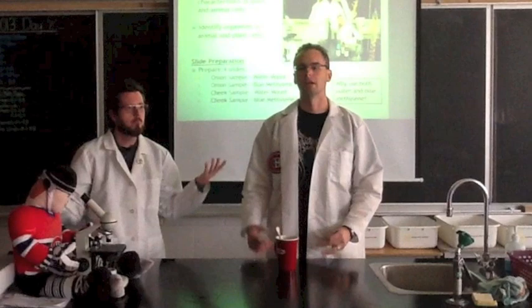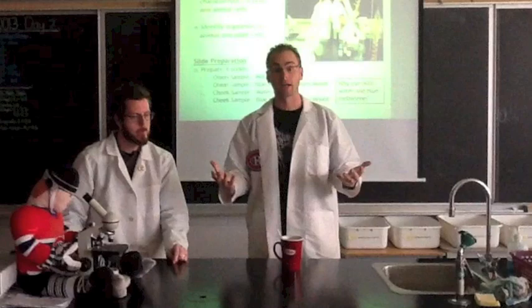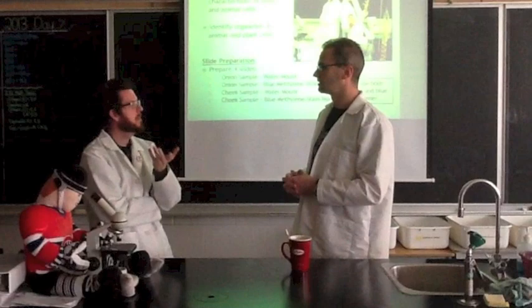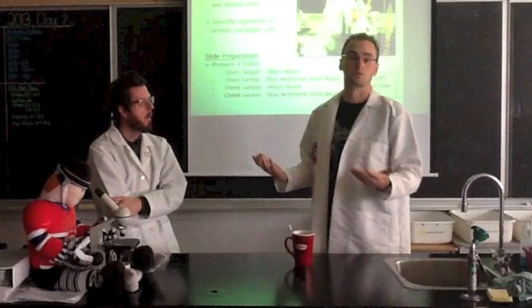In the lab today, we are going to take a closer look at animal and plant cells using an onion sample, so using onion cells. Yeah, I just get a little teary-eyed when we talk about onions. We're also going to be using cheek cells from us as an example of animal cells, and we're going to look at those samples under the microscope and compare them.